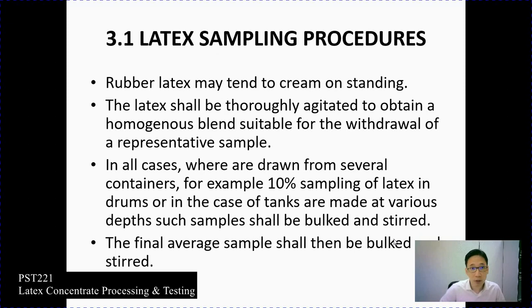If you see my video during handling the latex testing, we start with shaking the latex bottle so that your latex will homogenize when you take a sample for the testing.